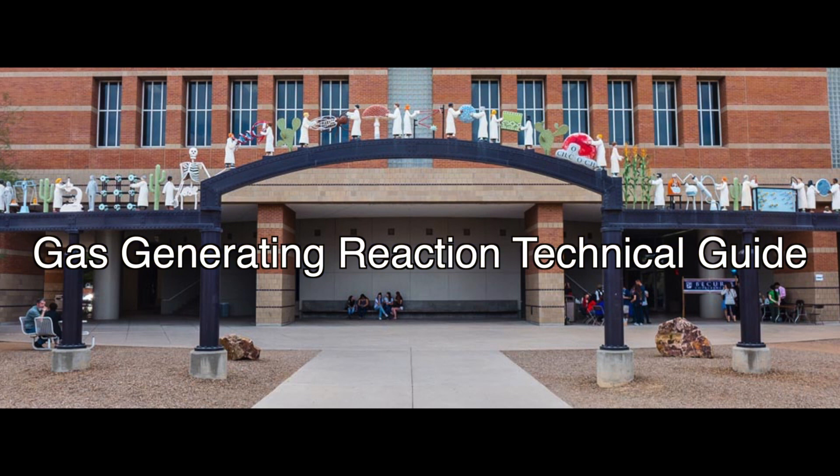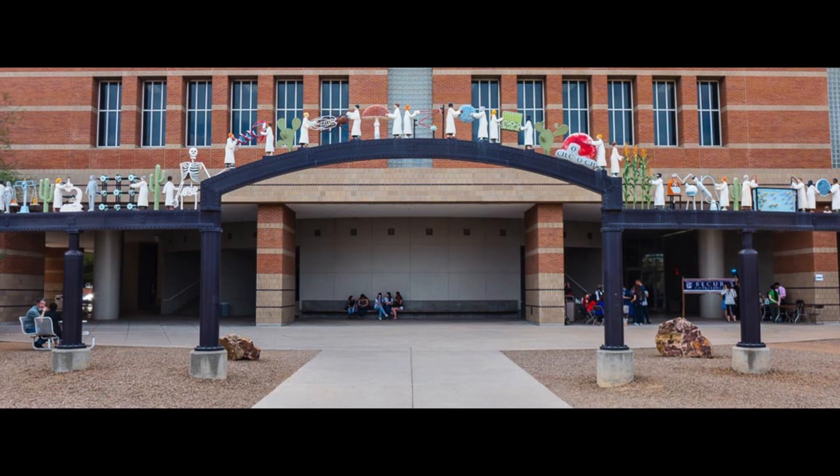In this video, I will demonstrate how to set up a gas collection device for use during an acid base reaction.